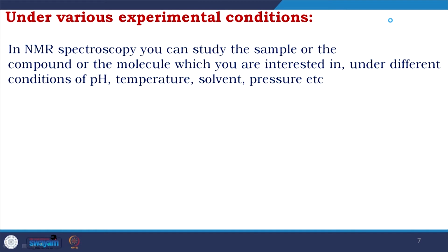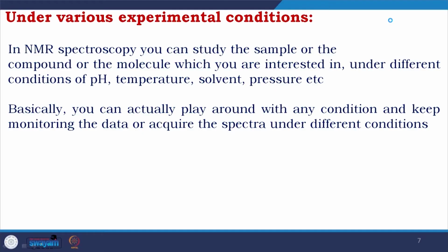So, with different treatments, whatever the effect is on the molecule, on the polymer, anything, with change of pH, change of temperature, different solvents, you could study everything using NMR spectroscopy. Basically, you can play around with any condition and keep monitoring the data or acquire the spectra under different conditions. So, this is even more interesting.